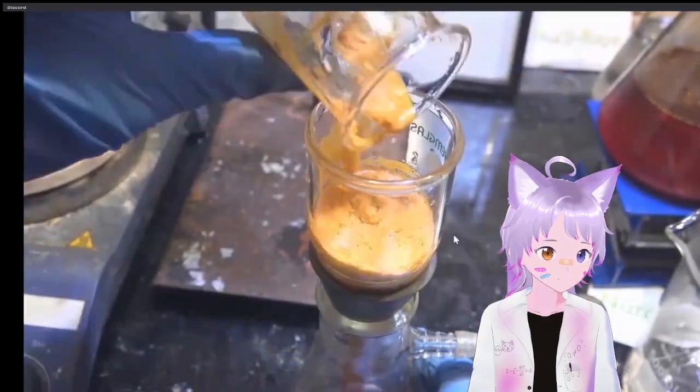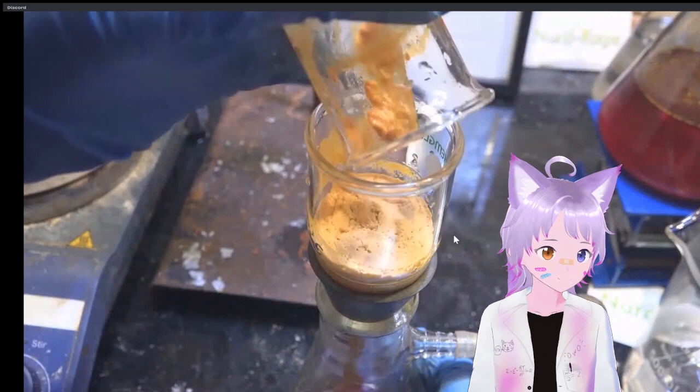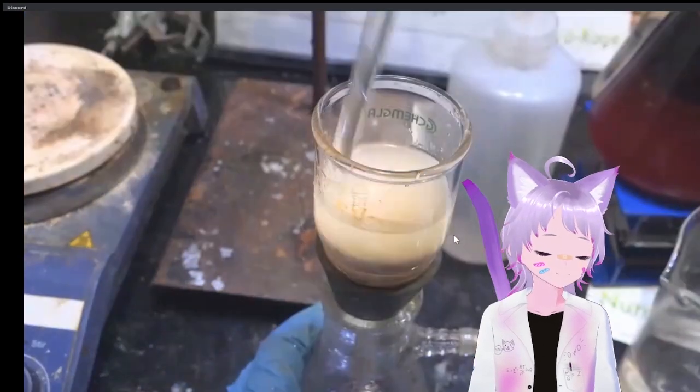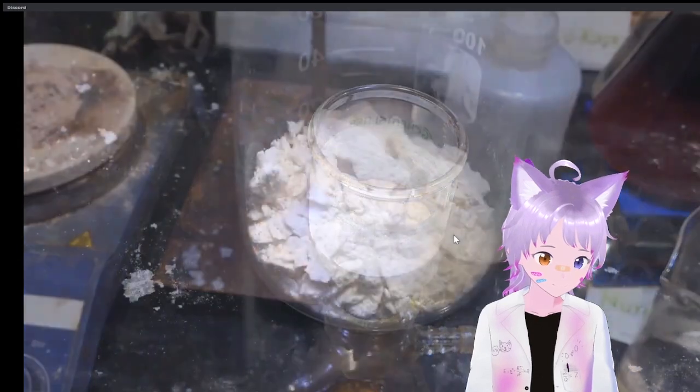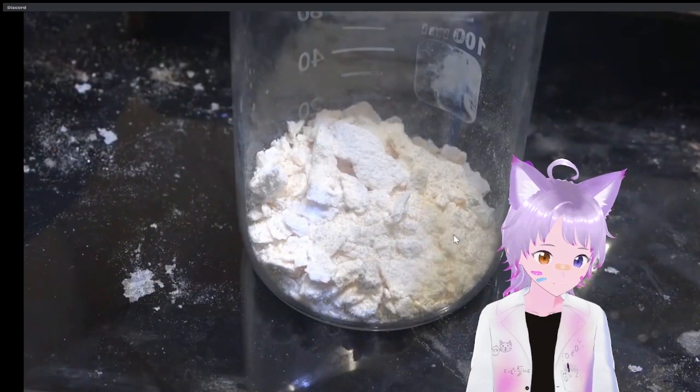Suction filter the mixture to get crude pyrimethamine. Wash it once with water and twice with ether to remove more of the impurities. Then let it dry in the filter. Scrape it off, and here is our crude yield of pyrimethamine at 5.5 grams.